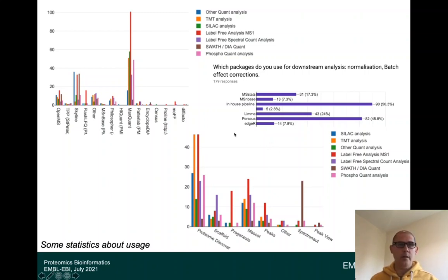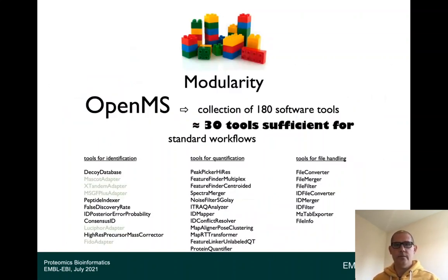Today I will be talking about OpenMS as an option or tool that can help the user to distribute the proteomics data analysis.